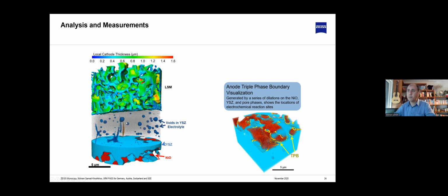In the first step, it's possible to investigate them, which is really nice, because if we want to investigate using a TEM lamella, that's almost the width of a TEM lamella which is normally prepared, but really thin in the other dimension. This means that if we want to look at the same width using a TEM lamella, we are in principle seeing just that thickness. So that's the width, but the volume is not covered. The probability that our TEM lamella is sitting in the right region is really low. This means we are not having access to a volume which reflects at least good statistics for our purpose, which I will explain now.